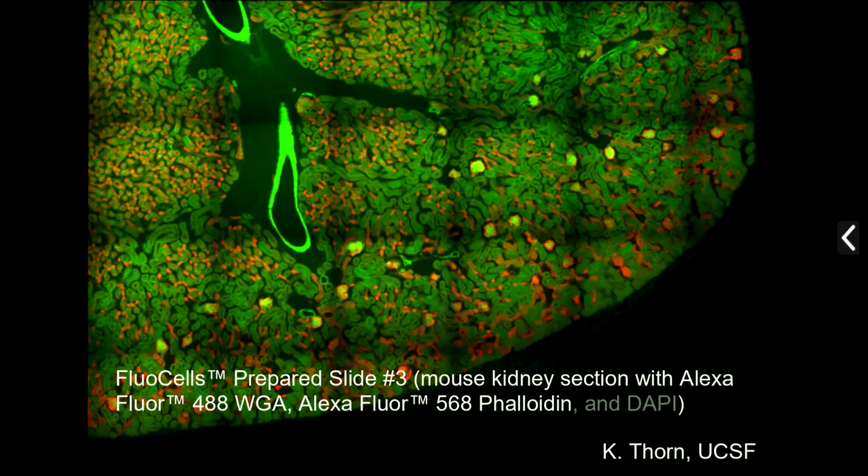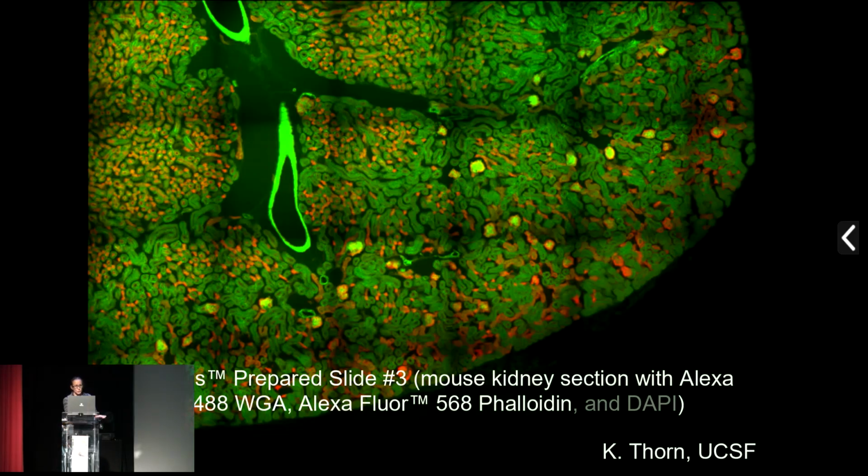So this specimen here is an image of a section about 16 micron thick of mouse kidney, and it's been stained with 3 fluorophores, but only 2 are visible here, and apologies for it being in red-green. These are not my data. These are data from Kurt Thorne's lab when he was at UCSF, and he's now made the sensible jump to industry. But it shows very keenly some of the problems when you're imaging on scales that are multi-millimeters or even centimeters in size. So the first problem that you see potentially is these dark borders that surround each one of the individual image panes.